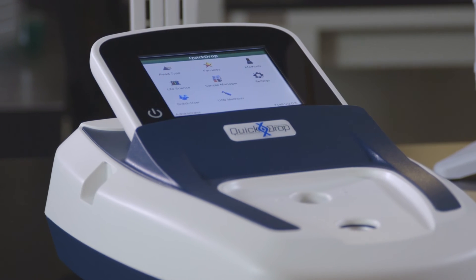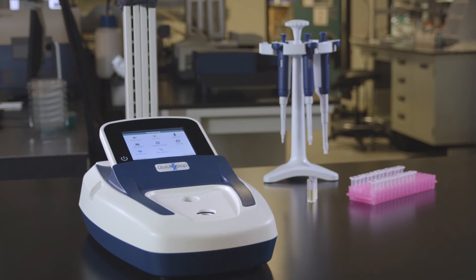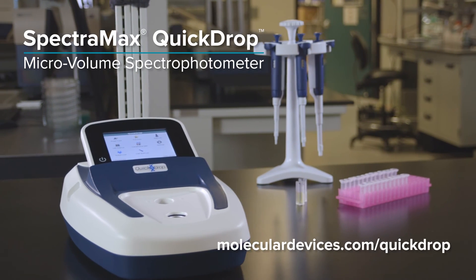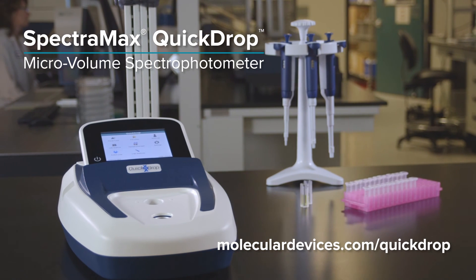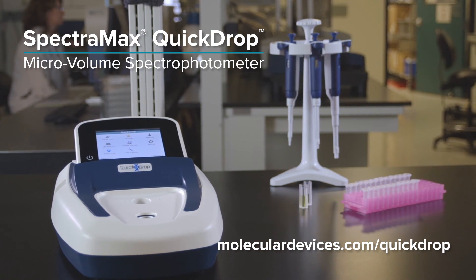The QuickDrop spectrophotometer is the optimal tool for scientists who regularly need to quantitate very small samples. Visit moleculardevices.com to learn how the QuickDrop micro-volume spectrophotometer can help you reveal the world of information from one tiny drop.